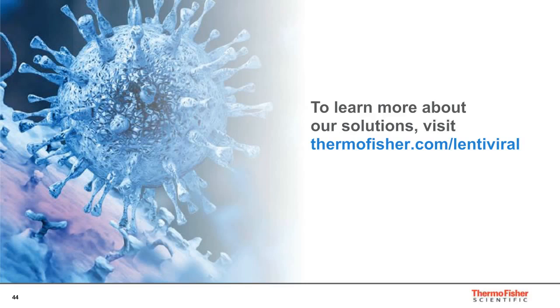Regularly monitoring the cell viability is also very important. Also, during lenti production, the accuracy of the cell count and the correct way to make the DNA transfection reagent complex are the other two primary factors that influence the viral titer.